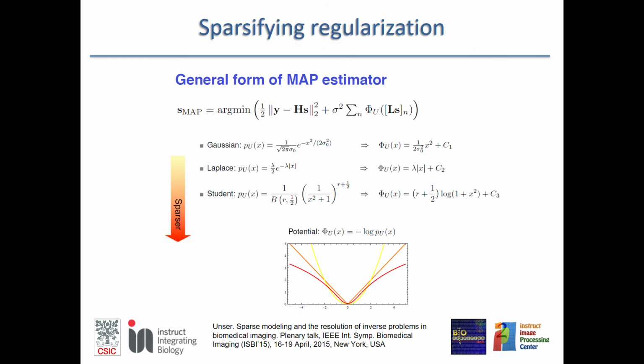Well, let's skip all this. The other thing is that you can have maximum a posteriori 3D reconstructions, and this maximum a posteriori is a scheme in which you want to minimize the reprojection error, and you also have some prior about the kind of objects that you want to reconstruct. This prior is formulated as a probability distribution function.